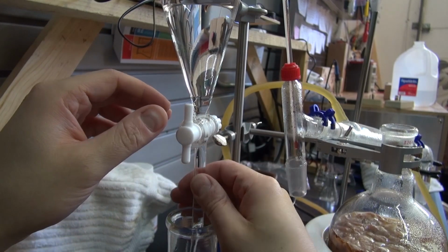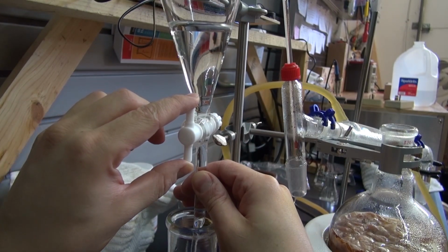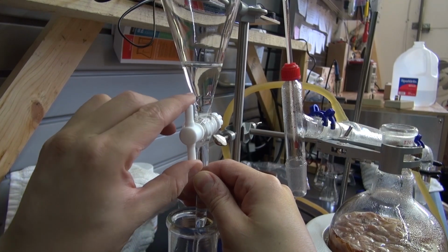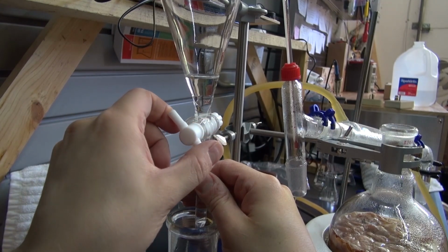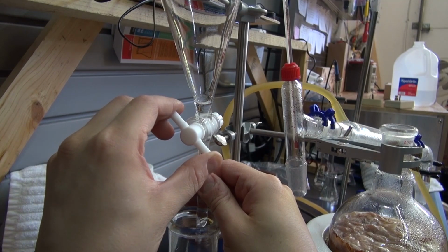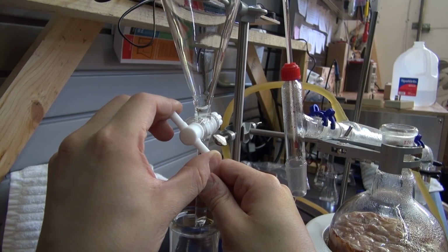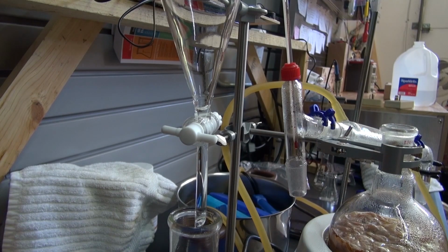So right now, I'm just letting the water pour out, and I'm going to see if I've collected any of the oil. It kind of looks like I did, just a very small amount. Yeah, there's some small amount of rose oil right there.